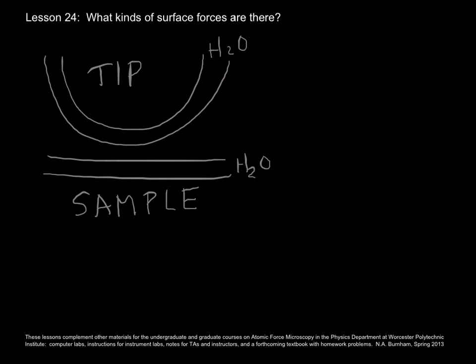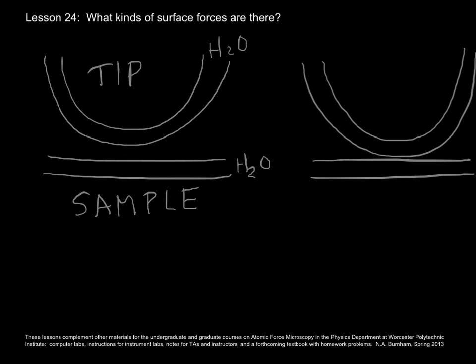of water behaves. Here I've redrawn it with the tip just a little bit closer to the sample and the water films on both tip and sample.